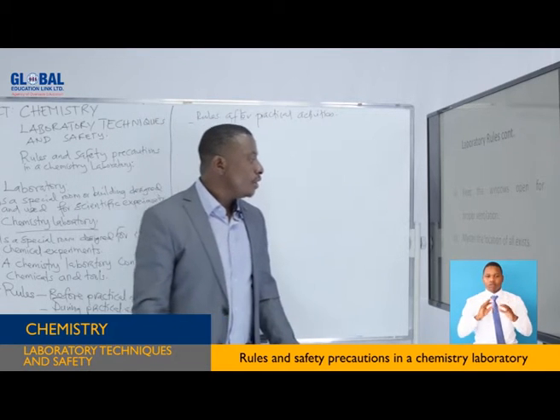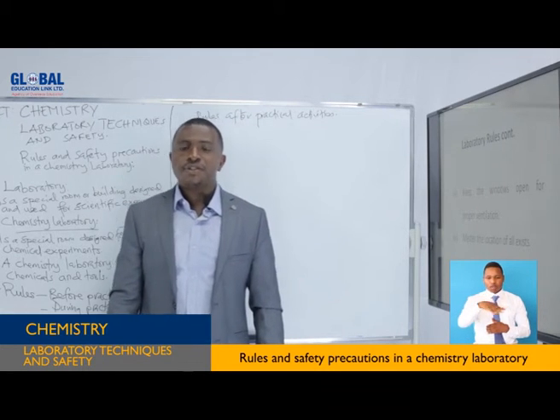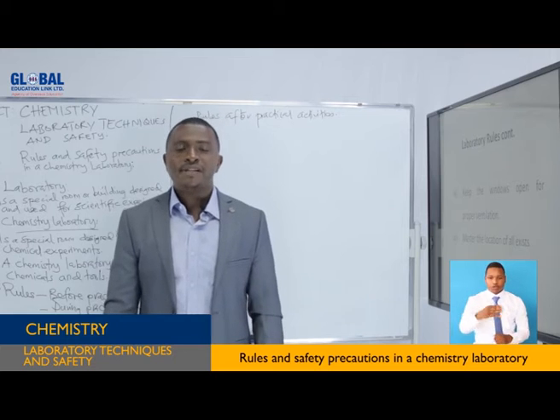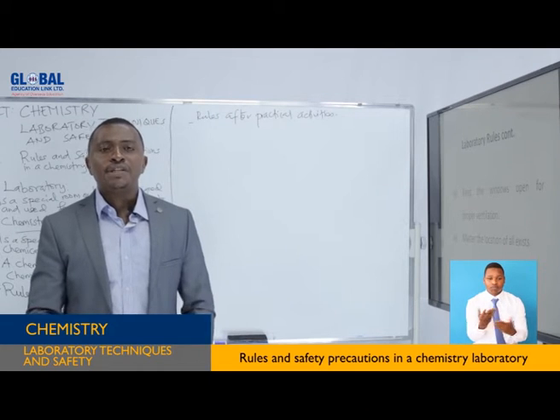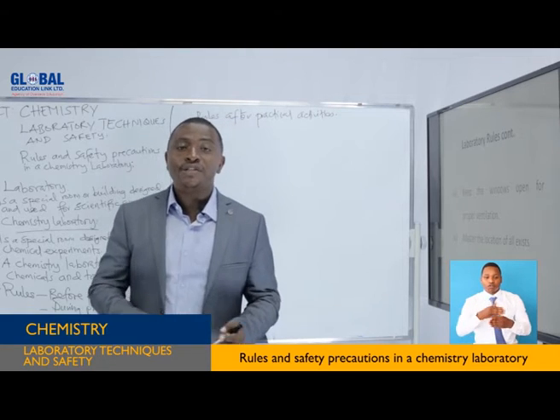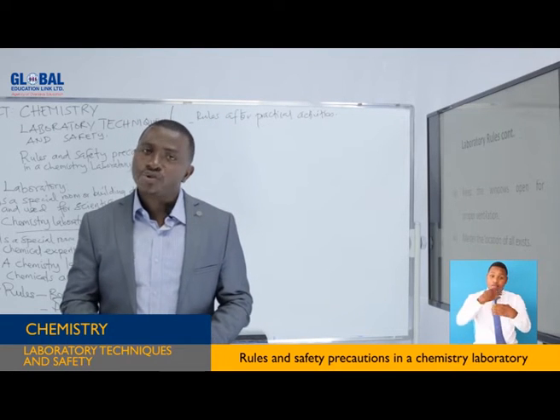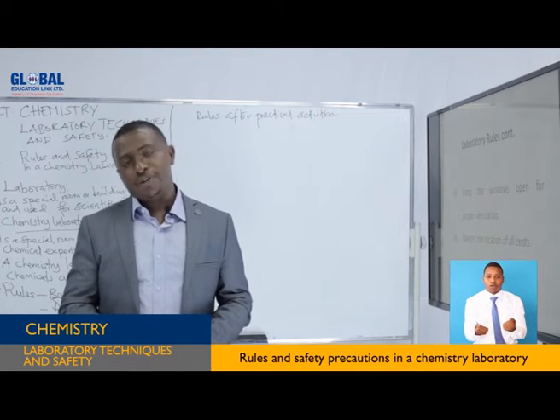You are also required to master the location of all exits. Please, when you are entering your laboratory, master the location of all exits. Master the location of the exit door. Master the location of the exit of waste. Master the location of the exit of harmful gases. It's because within the laboratory there are dangerous chemicals, so in case of an accident, it can be very easy for someone to move out of the lab.